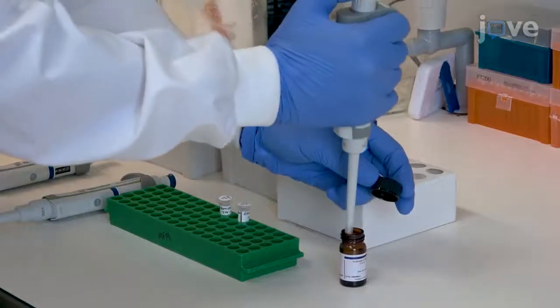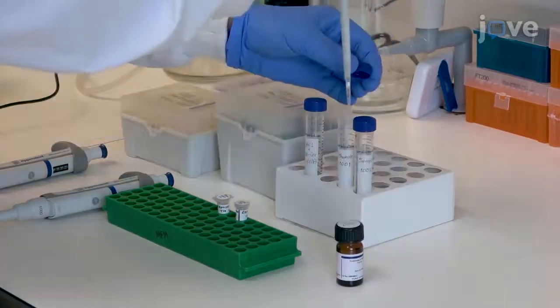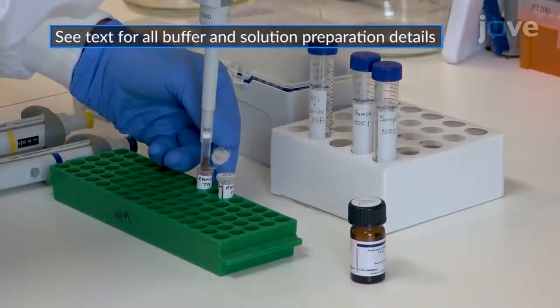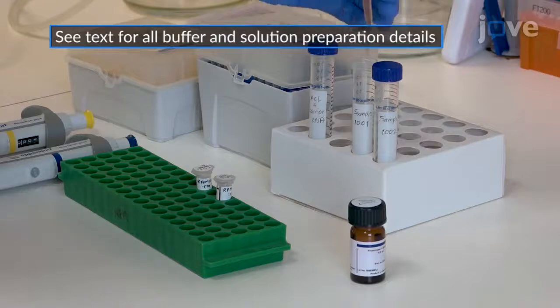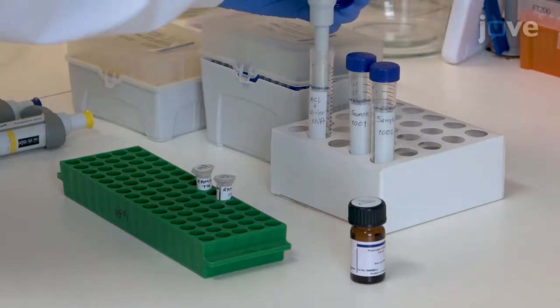To isolate circulating cell-free DNA from a patient plasma sample, add 100 microliters of Proteinase K and 800 microliters of lysis buffer supplemented with 1 microgram of carrier RNA to 1 milliliter of patient plasma.